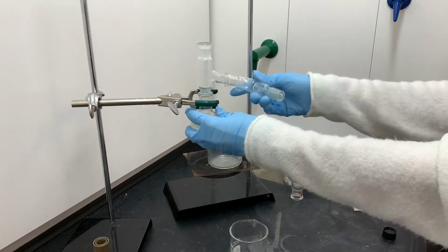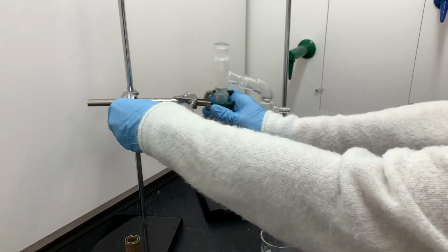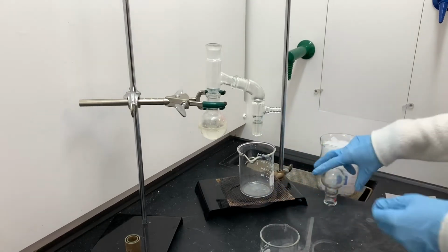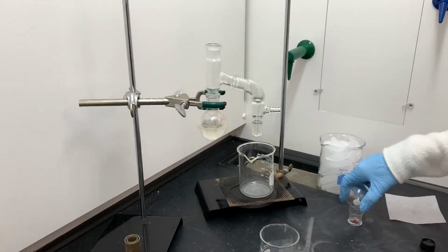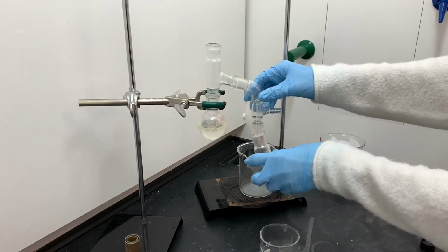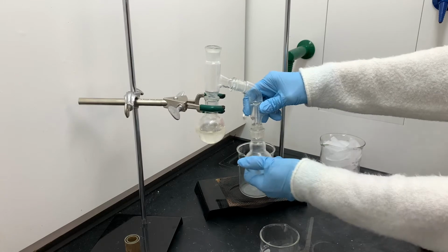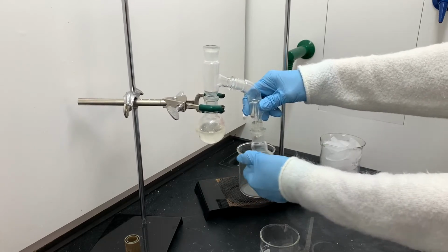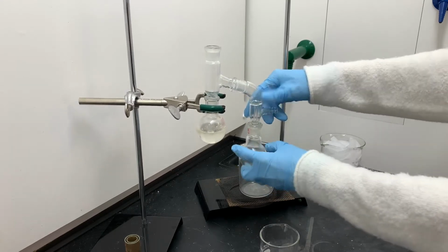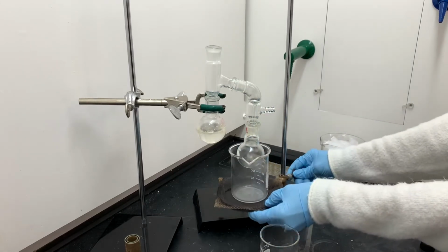This is the second piece that I'm attaching. This is another adapter. This is what's going to ultimately connect to the receiving flask. Now notice that this adapter has a little spout on the end of it, just one spout. So not for water. It looks kind of like something that we might plug a vacuum into. That little spout on the end is used to hold what's called a drying tube. That would be something that we would use if we were not doing this reaction inside a fume hood. A drying tube is used to help absorb any smells or fumes that are coming off of the reaction. But since this reaction is being done inside a ventilation hood or a fume hood, I don't need to attach anything to that little port, that little opening.